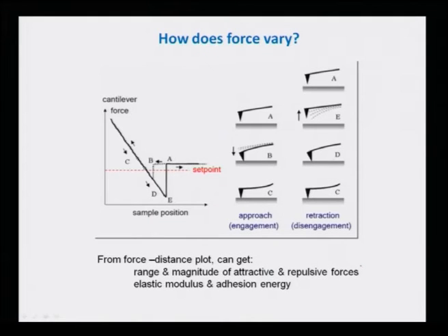Now, how does the force actually vary? Let me just tell you in a simple slide like this. So, how do we actually measure? As you know, in AFM one can measure the force versus distance plot also. So, this is the sample position, this is the cantilever force, and these are the different positions A, B, C, D, E, and I am showing you the position of the tip.